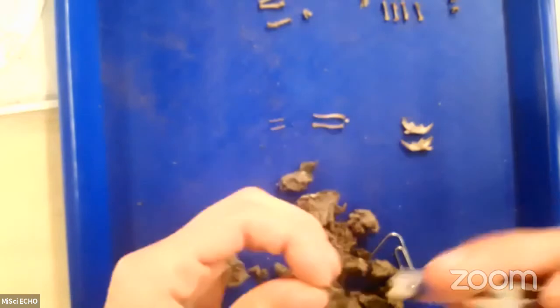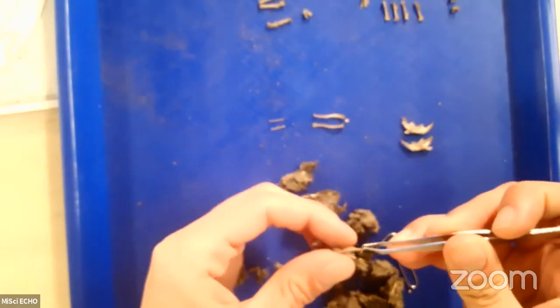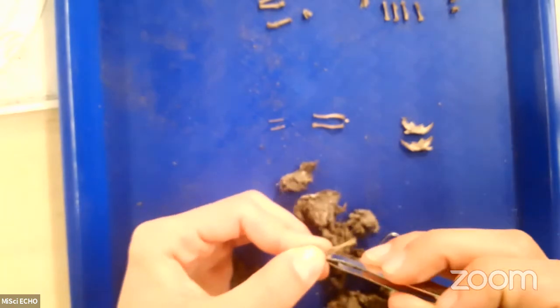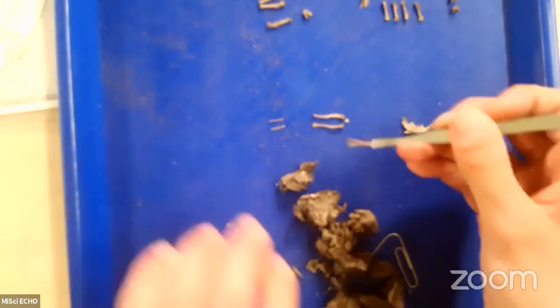Let's see what else we have. And remember that if you have questions throughout the program, keep sending them to us in the chat. I would love to keep answering some questions as we go. Like we said, this is a very patient type of dissection. It takes a little bit of work.